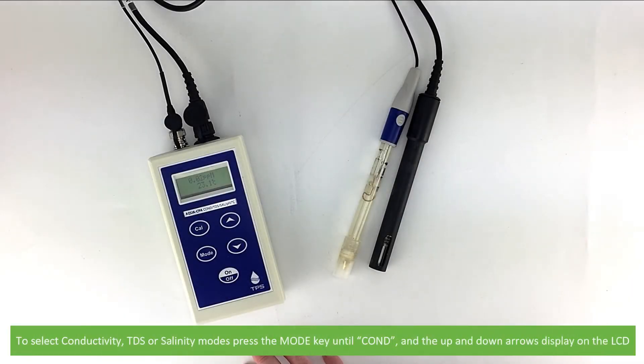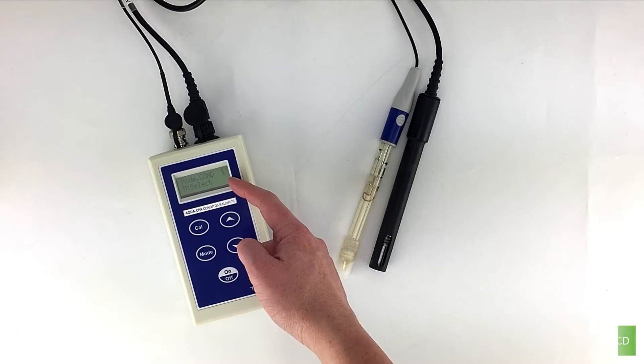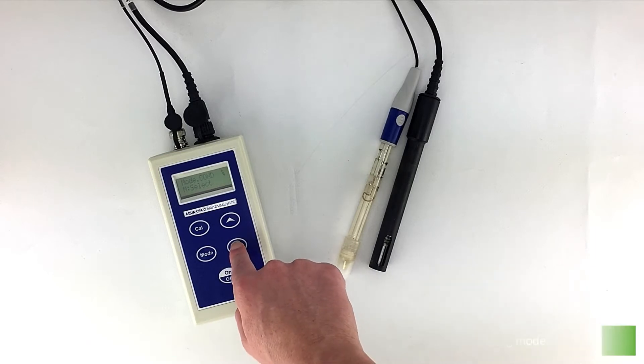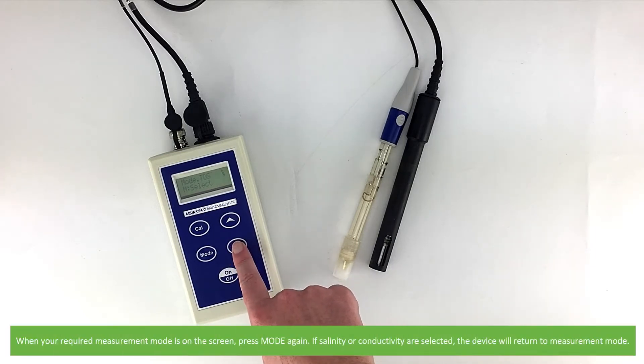For mode selection, to select conductivity, TDS or salinity modes, press the mode key until COND and the up and down arrows display on the LCD. Then use the arrows to select between conductivity, TDS or salinity measuring mode. When your required measurement mode is on the screen, press mode again.